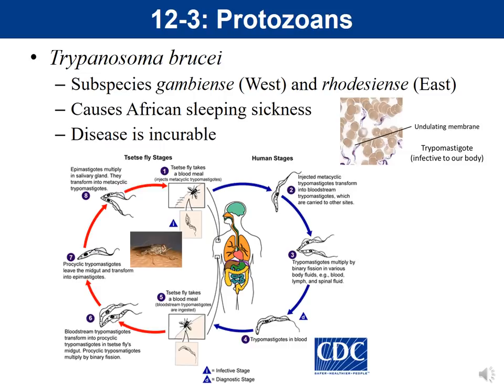The disease caused by Trypanosoma brucei is called African sleeping sickness. The method of motility is using what's called an undulating membrane. Looking at this organism, the pink cells are red blood cells, and in among the red blood cells you can see those spirochete-looking organisms — that is Trypanosoma. Those spiral-looking organisms move through an undulating membrane, meaning they have a wave-like motion.